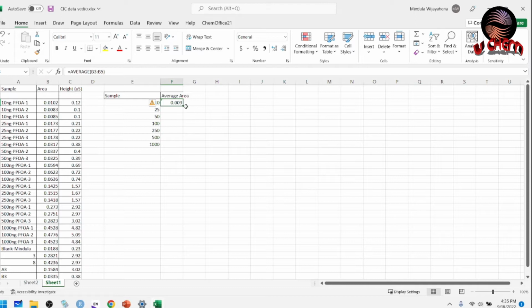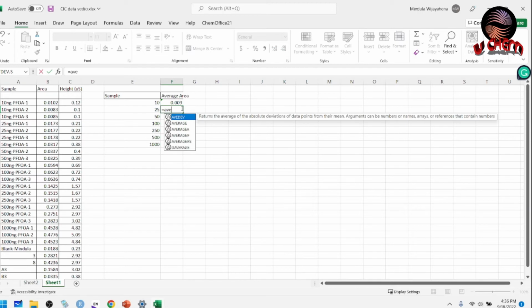See, it's giving you the average signal for that particular concentration. Likewise, you have to do it again and again for the entire set.